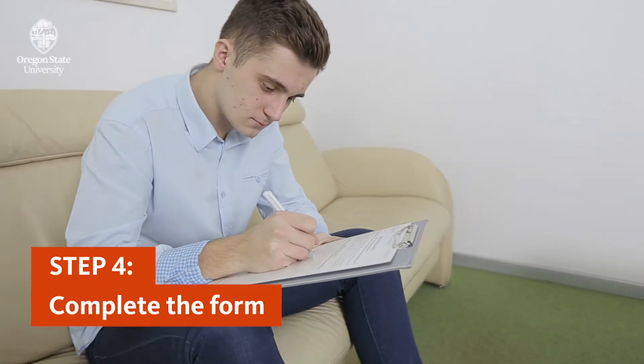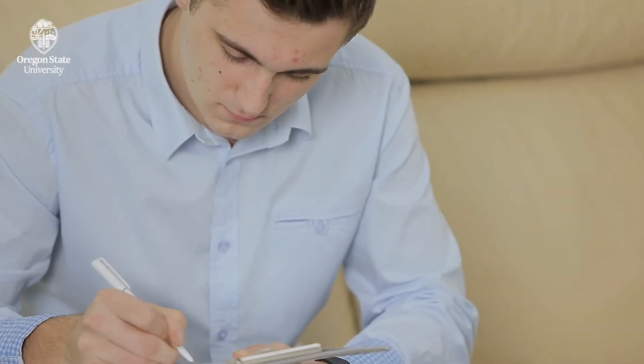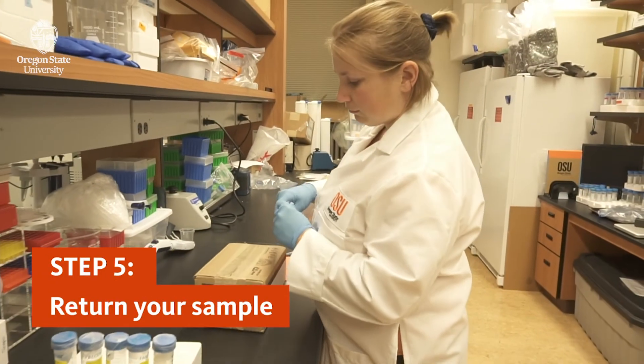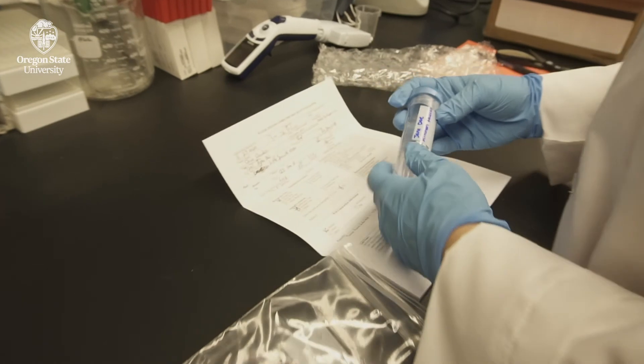When you use a commercial laboratory, they'll give you a form to fill out when you take your sample. Make sure you fill out the form and mail it back with your sample. The laboratory will need to receive your sample within 24 hours of collection. Talk to the lab about how you should send the sample back.